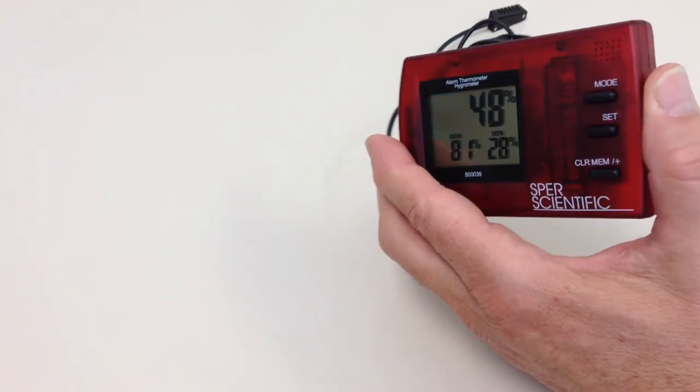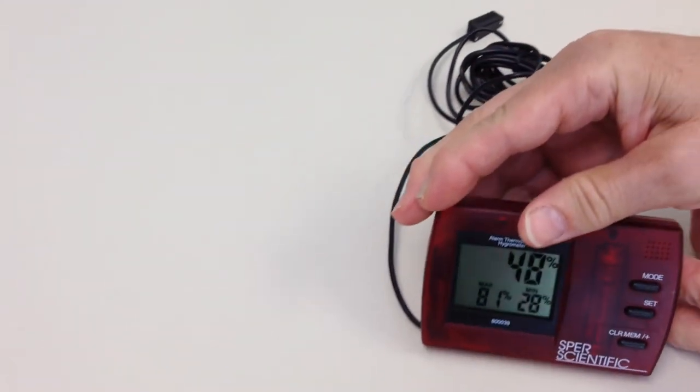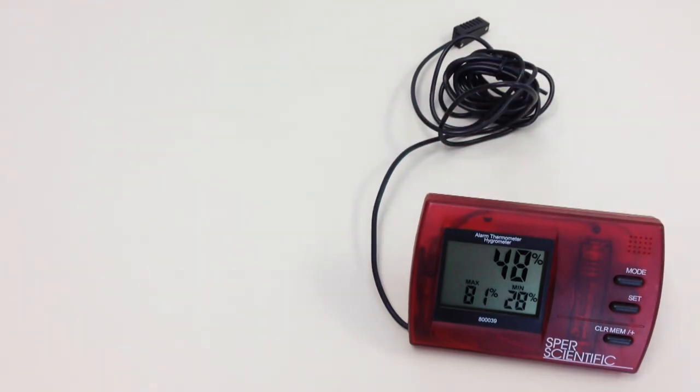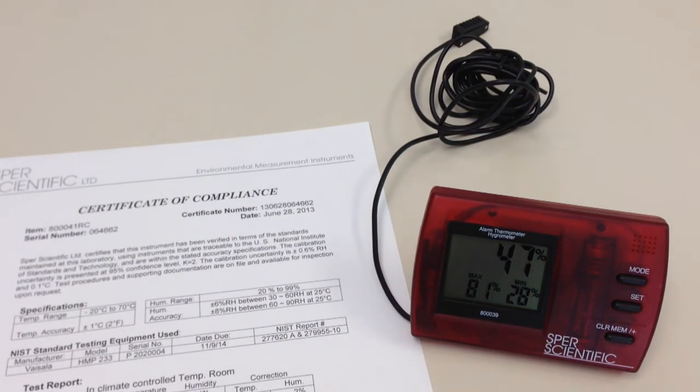You can select a centigrade or Fahrenheit display. The unit stands or wall mounts and comes with one AAA battery. An NIST traceable certificate of compliance is also available as an option.